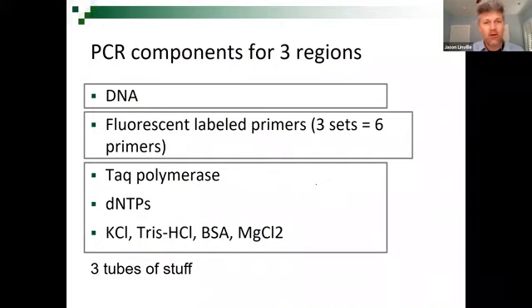Okay, so it's good for when we run all of our DNA, if we were allowed on campus to do that, we would see that everybody would have 3 pairs of numbers, and everybody would have a unique 3 pairs of numbers. Your 3 pairs of numbers would be different from everybody else's in a class. So it's really good for teaching and research.